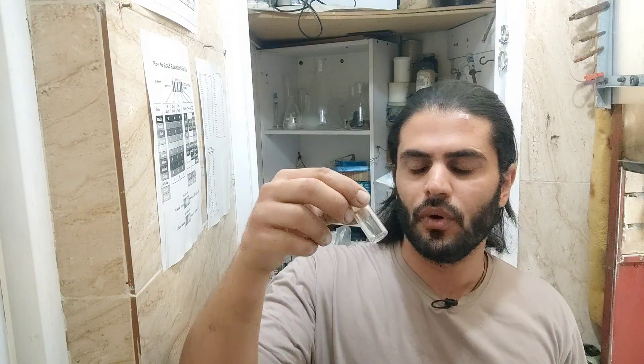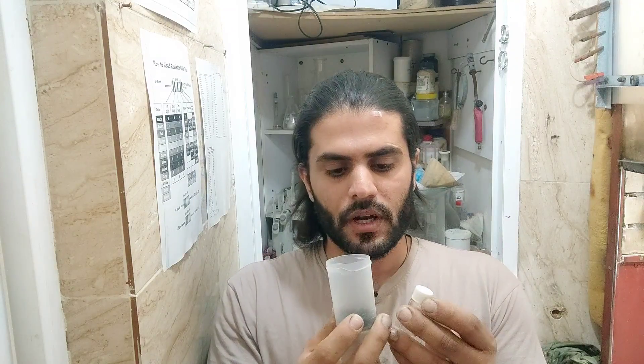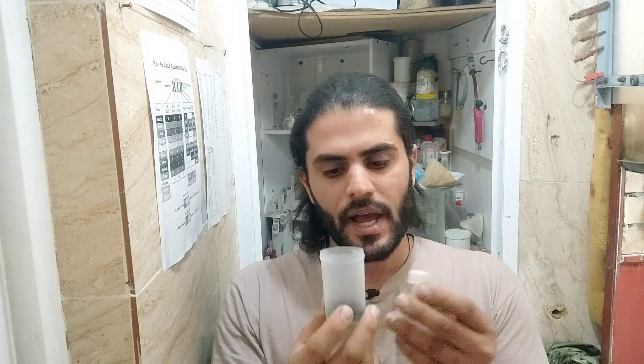Hi friends, welcome back. Today I'm back after about four months — I haven't been recording any video because I was making my own refinery workshop. I made my own furnace to process e-waste materials through the smelting and cupellation process. For today's video I have some raw gold powder — about seven grams of impure gold powder — and about a one-gram bead of gold. I'm going to refine both with aqua regia to get pure gold, keeping the two batches separate to calculate yield for each.